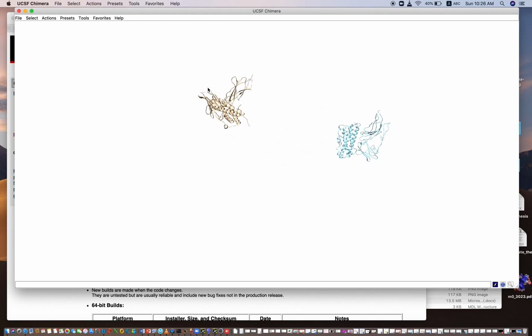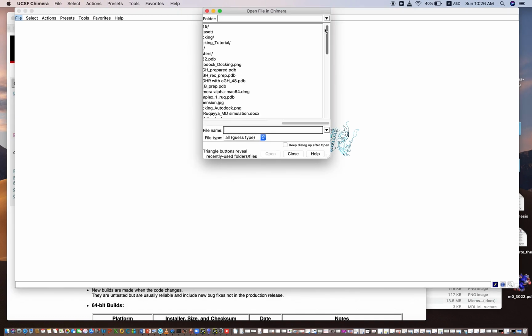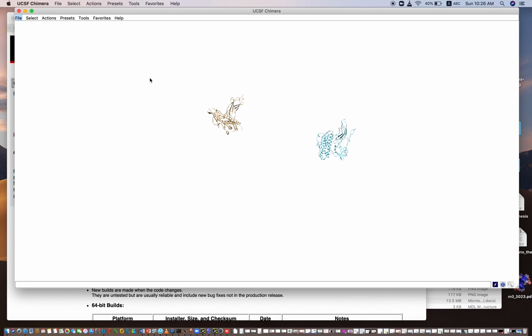I first uploaded the complexes simply: you can upload a complex by clicking Open and selecting it, and then here there is the blue window. If you click over here, you can select another complex as well, or again go to File, Open and select the other one.